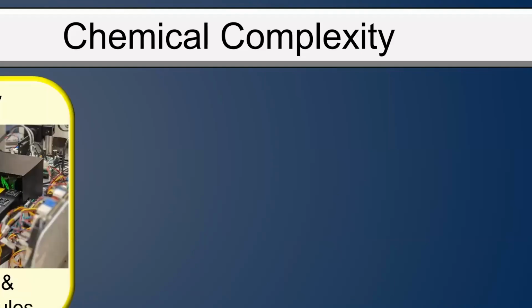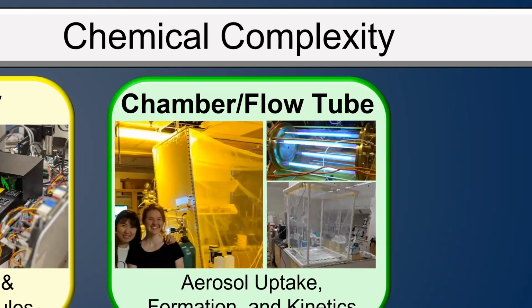And so we start in the lab where we use model systems, synthesized molecules, very simplistic but well-characterized samples that we can understand, connect with things like density functional theory, other sorts of computational or experimental methods that are really going to give us an idea as to what's going on with these particles. We then can do flow tube chamber studies. I'll talk a little bit about what we call a marine aerosol reference tank, where we can make particles in the lab from water in a representative way as to how it happens over the oceans or Great Lakes.